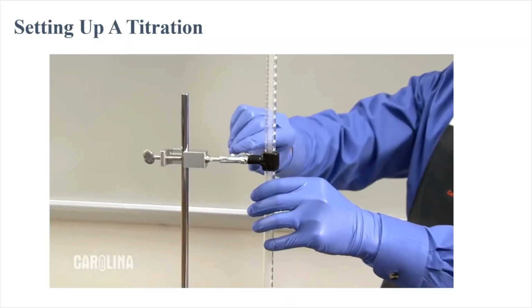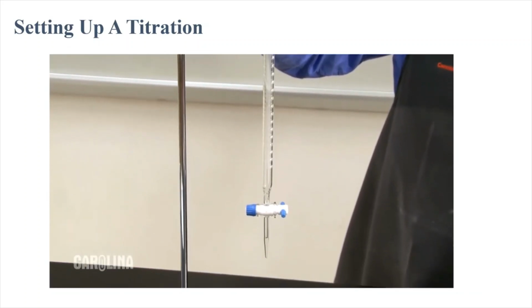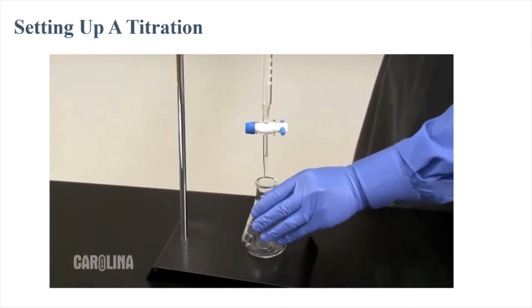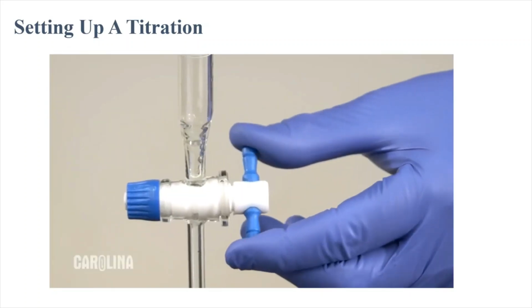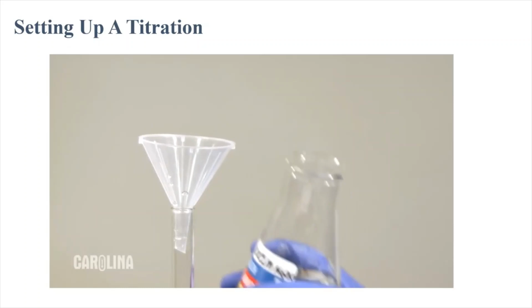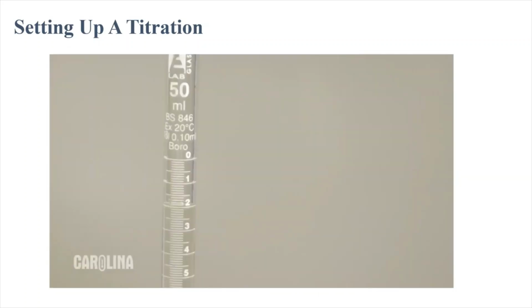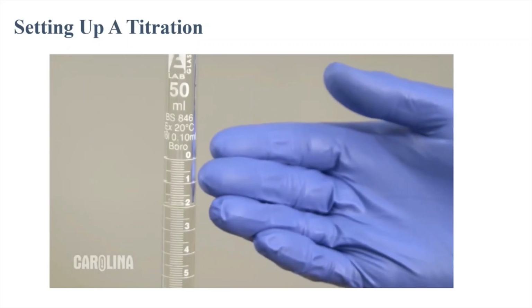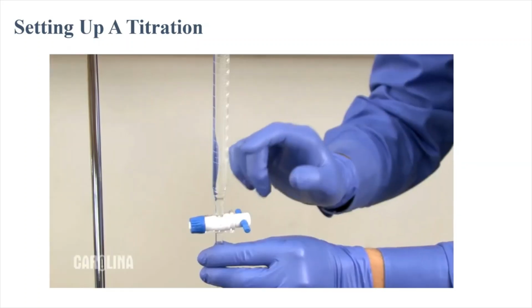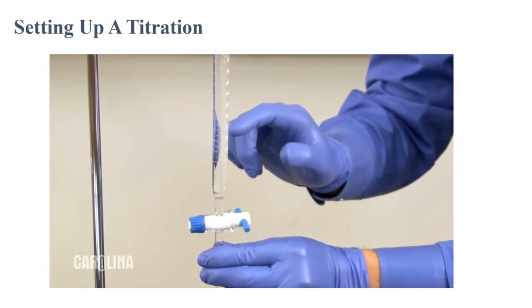Mount the burette in the clamp, making sure it is positioned vertically, and there is enough room to position your flask underneath the tip. Check to see that the stopcock is in the closed position. Insert the funnel into the top of the burette and fill with titrant almost to the top. Filling exactly to the 0 mark is not necessary, but you do need sufficient titrant to complete the reaction. Check the column for air bubbles and gently tap to free them from the side walls.